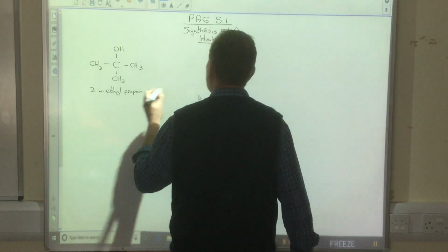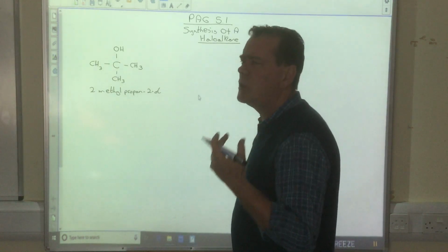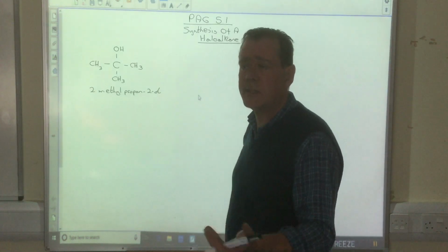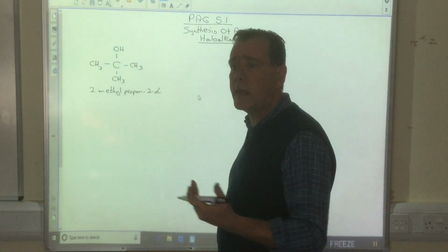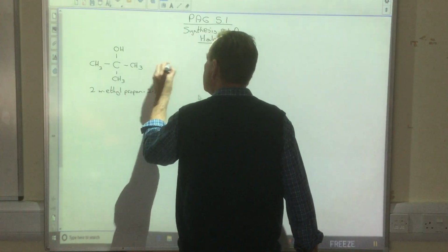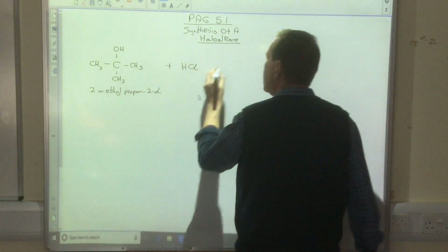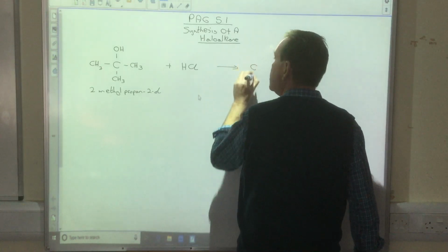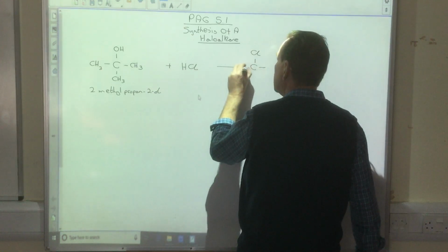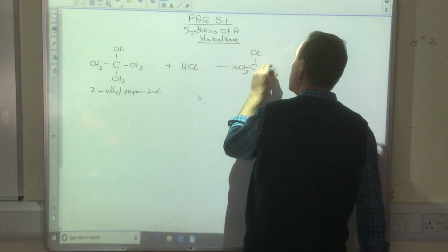You need something with a halogen. I'm going to produce a chloroalkane, so I can use sodium chloride and acid or directly hydrochloric acid. I need the chloride in the mix in order for it to act as a nucleophile. In this particular reaction, I'm using concentrated hydrochloric acid, and we are going to end up with this. Simple, we substitute the OH for the Cl, everything else stays the same.